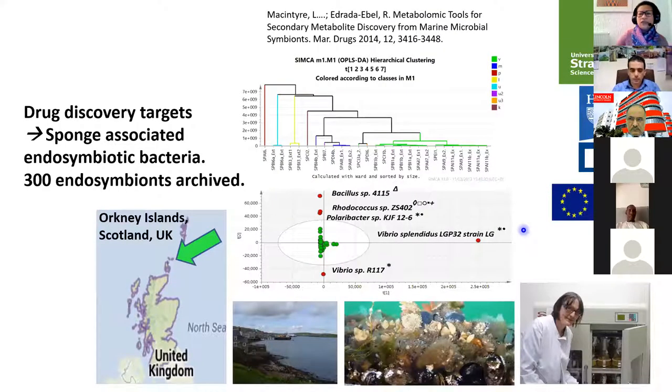Okay, so we did start using metabolomics because we had to deal with this really big challenge of analyzing a large number of raw materials. This was a pilot project and we were faced with 300 microorganisms. And in 1 week's time, we had to make a decision which strain would be the best to scale up. So we did three things: NMR, mass spectrometry, and a bioassay.